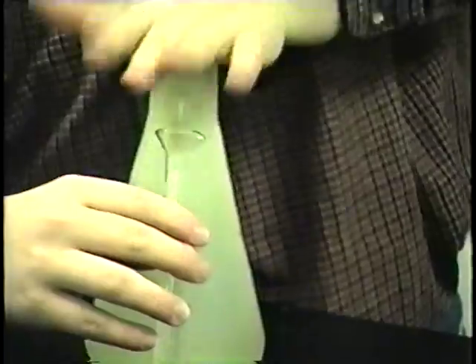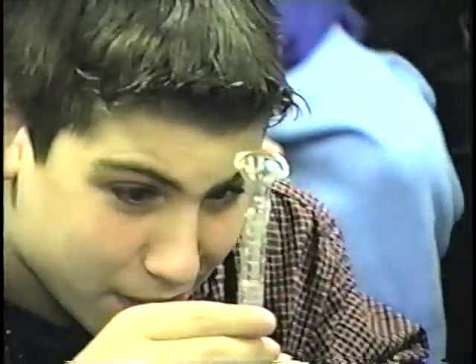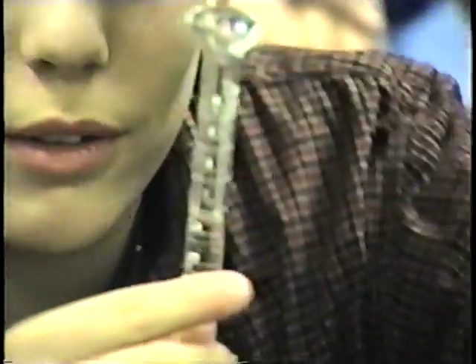So the water that is coming out right now is the volume of that piece of metal. Now that thing that he's catching it in, what is it called, the thing that he just caught the water in? A beaker. No, it's not called a beaker. A graduated cylinder, okay? And what unit is it measuring in? What metric unit? Milliliters. And Phil, if you would look at the meniscus, what's the meniscus, Phil? 6.0. Yeah, but what does meniscus mean? Oh, the little dip thing.